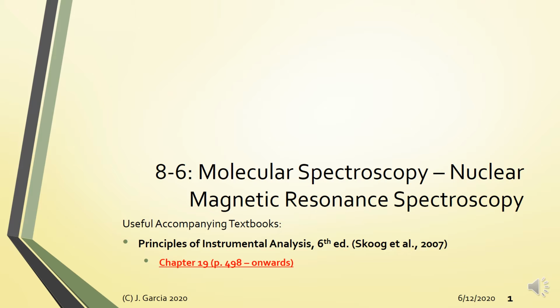Yung interpretation, konti lang, no? We'll just review some concepts of NMR spectra interpretation. But then the more detailed explanation will be given in organic chem, or was given already, no, in organic chemistry.